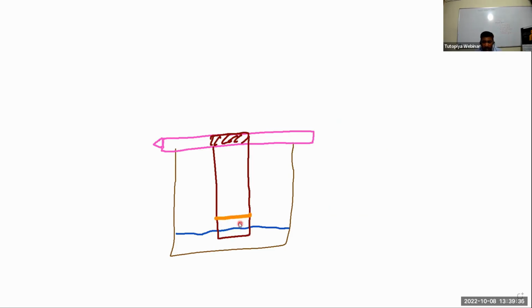Okay, your ink line should be above. If it's about to dip inside the water, remove some water or fold this paper here. And you leave this for about 1 or 2 hours. All this water is absorbed by the paper and it passes through the ink line and goes up. As this water moves through the ink line, it separates the various components in that ink.